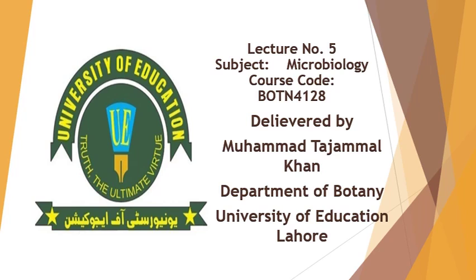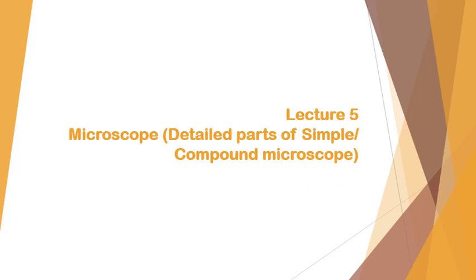Our today's lecture comprises one of the most important items. Without it, microbiology is nothing, and that is the microscope. Today in this lecture we discuss the detailed parts of the simple or compound microscope.